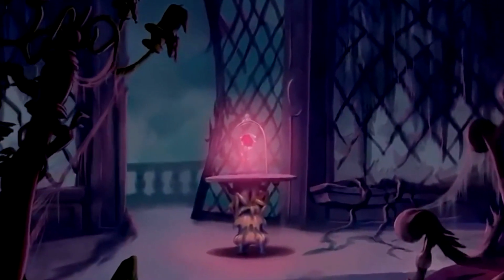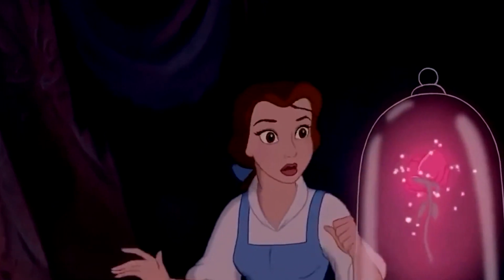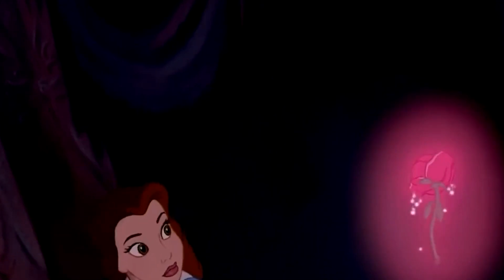Just like the protagonist in the film Beauty and the Beast, a rose will play a key role in this next experiment. However, our approach will be totally different. We will decolorize our rose with some chlorine gas. Let's get started.